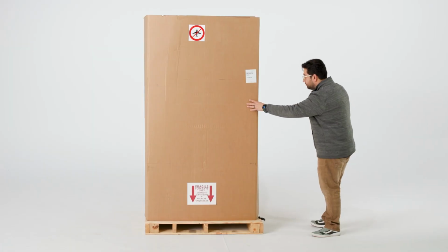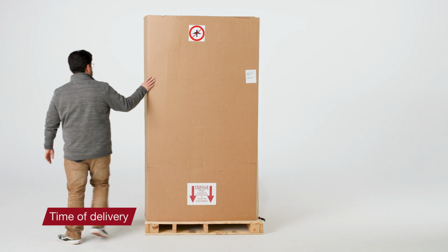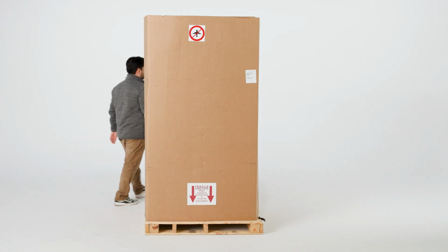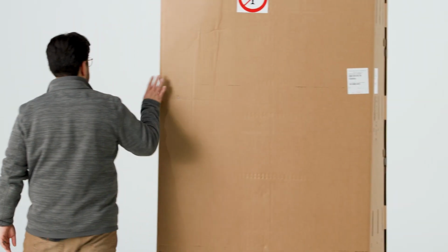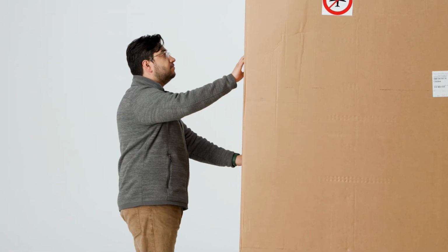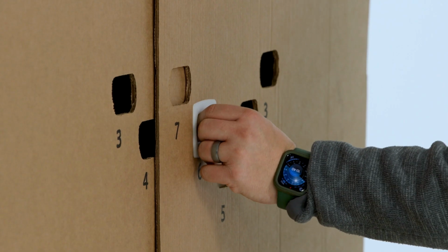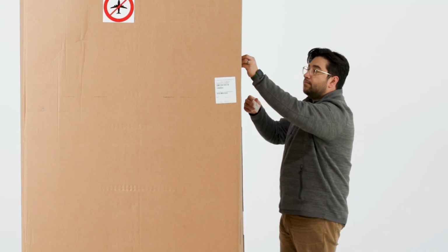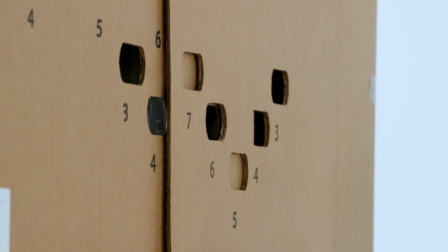When you receive your freezer delivery, examine the exterior packaging for physical damage while the carrier's representative is present. If you notice any damage, carefully unpack and inspect the unit and all its accessories immediately. If there is no exterior damage, unpack and inspect the equipment within 5 days of delivery. If you find damage, keep the packing materials and report the damage to the carrier right away.